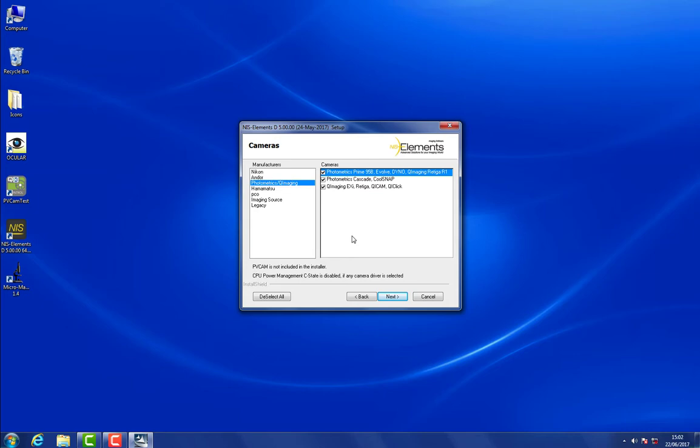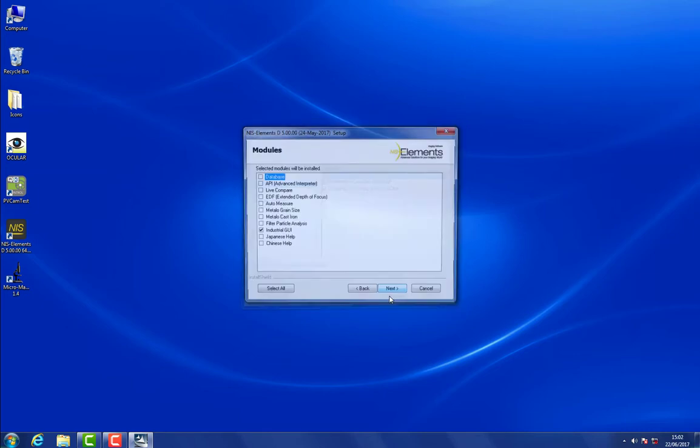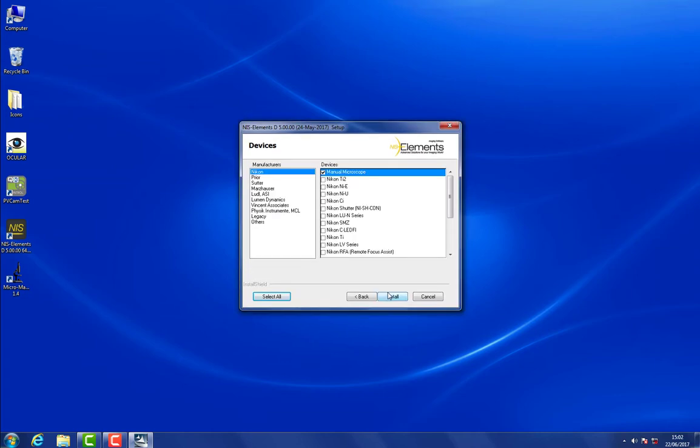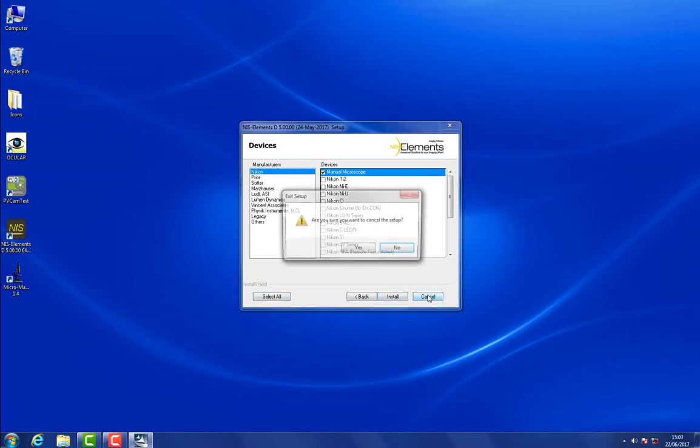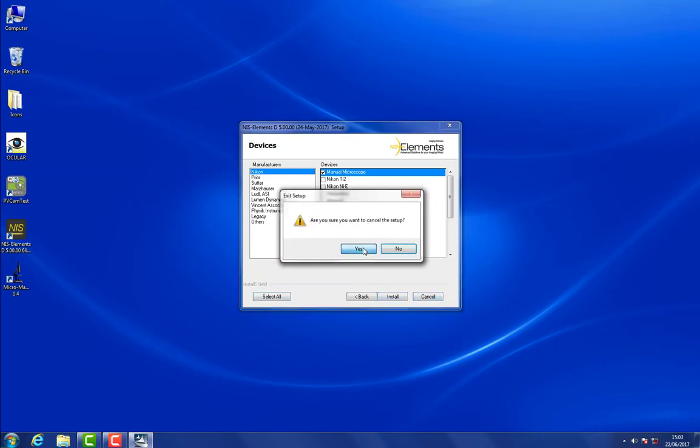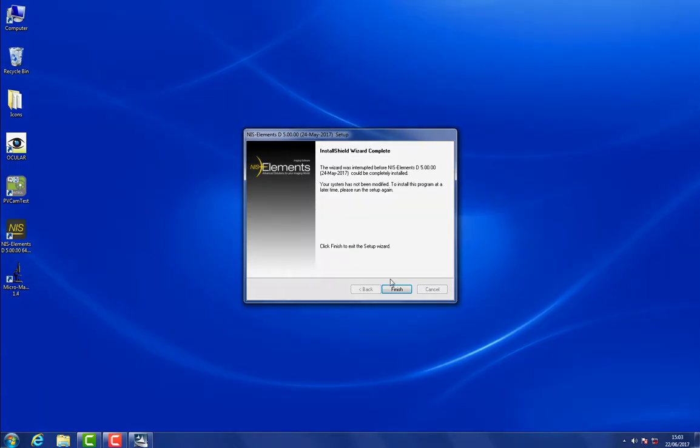And you can set up the rest of your optical system, the other components that you have. In this case we just have a manual microscope. So then you can finish the installation, or in my case because I've not changed anything I'm just going to click Cancel. And there we have it.